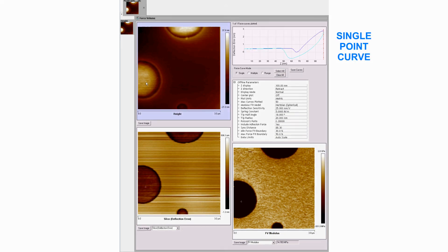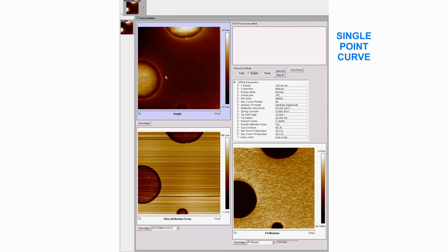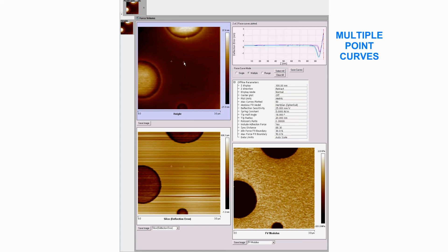Display options include selecting data from single points in the image, or to overlay multiple points for comparison, or to display curves from multiple points within a defined region.